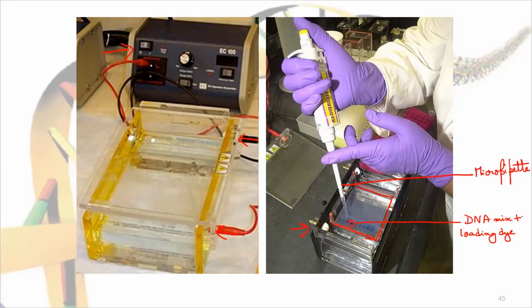Otherwise DNA does not have any color. Because the gel is transparent and the buffer is simply water with certain electrolytes in it, when you put the dye in, it becomes visible, and you can see, like here, when this person is loading, he can see the blue color getting settled at the well, which means that the loading is happening successfully.